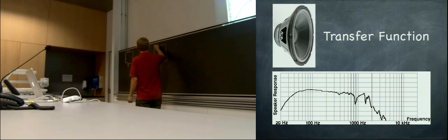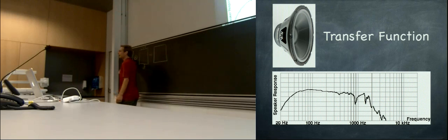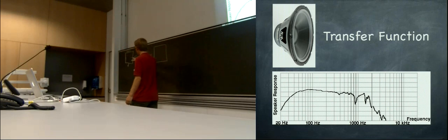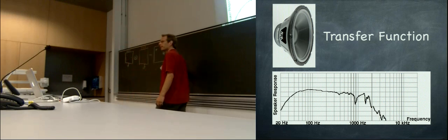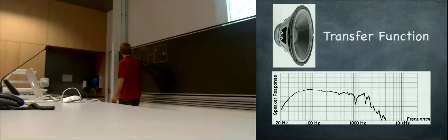And the image, especially if you defocus the electron microscope a bit, does not show you one atom and one atom. Only a CS-corrected microscope with sharp focus would do that. But in biology, when you defocus to improve the phase contrast, what you see instead is some funny ring structure from the defocusing. And what happens here is that you have your atoms and it's convoluted with your point spread function, which has this profile.